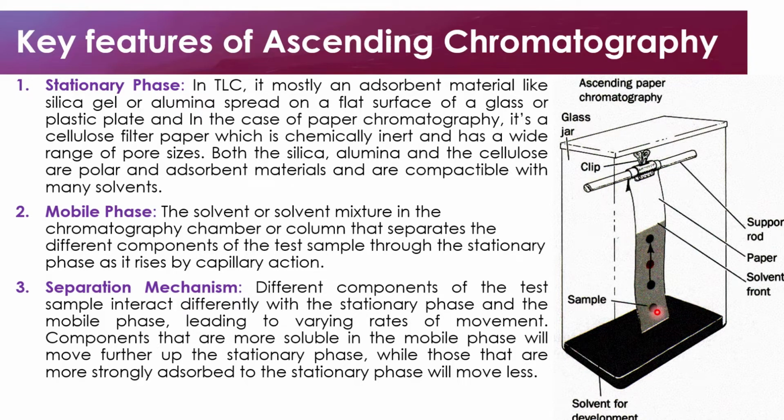This is our spotted test sample over here, and these are the various components separated as the mobile phase moves upward by capillary action through the stationary phase.